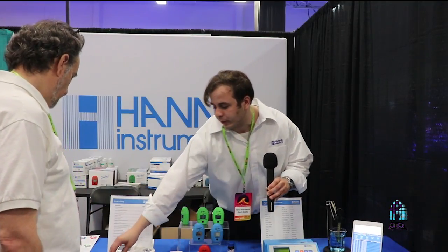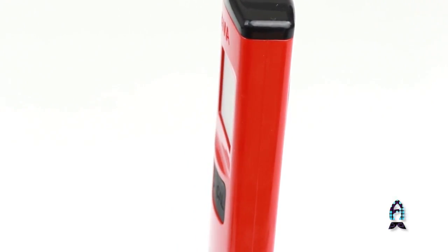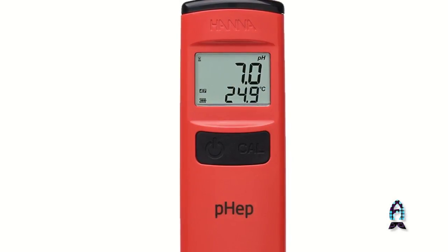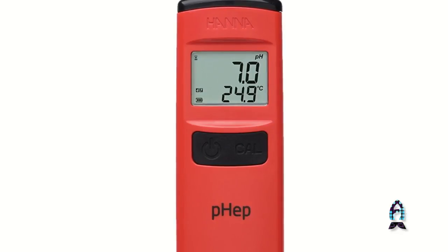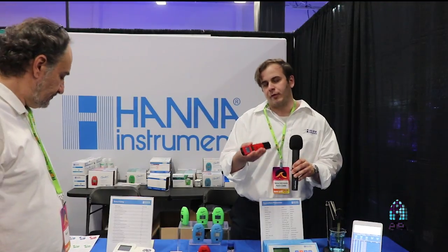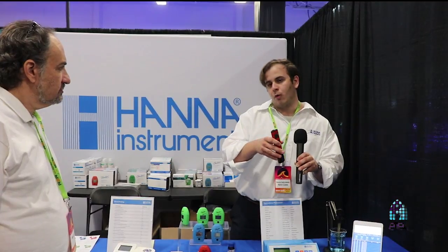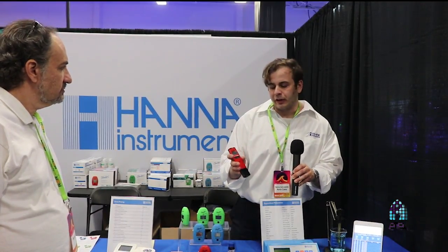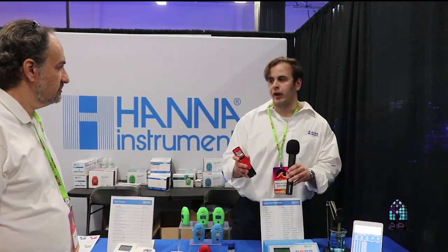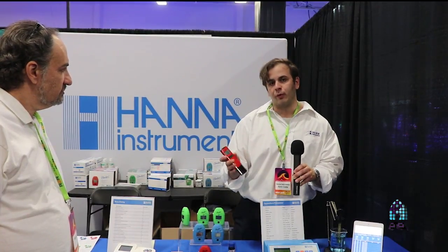Another product we recently came out with is this waterproof pH and temperature meter — it's called the HI-98107. It retails for about $40. You get your pH meter, it's waterproof, it measures temperature, and in addition to measuring temperature it also adjusts the pH reading based on that temperature. If you measure a pH sample where the water is 55 degrees, the pH might read differently than if that water was 75 degrees from an electrode standpoint. This takes into account any differences associated with that. It comes with calibration buffers, a case, and retails at a great $40 price point — another well-received improvement to the hobby.